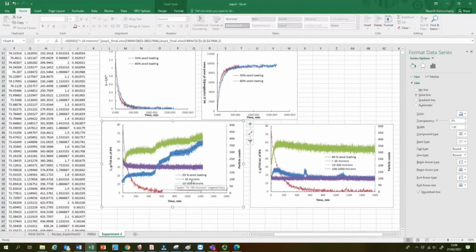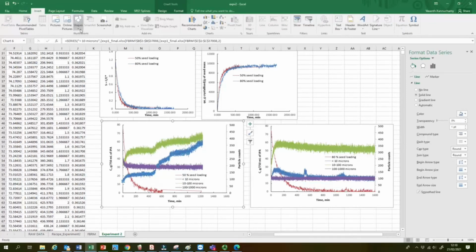You see the particles which are less than 10 microns continuously increasing during the crystallization experiment, and also for particles 10 to 100 microns, you see a slight increase in the number. So we started the experiment roughly, you have to follow my arrow. Maybe I can put some line.